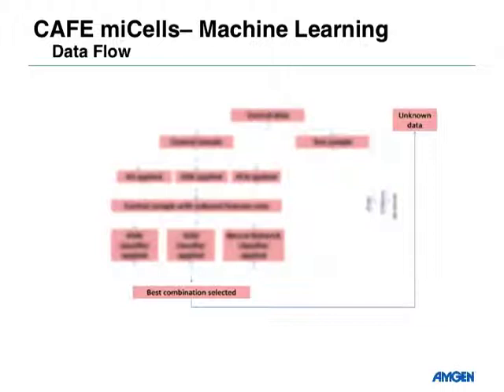One of the things that we've used is a software package called CellProfiler Analyst. What this does is it uses a couple of different techniques. It asks you to get your positive and your negative controls, and potentially something that's in between. The first part is you take your control samples and use something like KS statistics or principal component analysis to figure out which of these 700 features are really important.